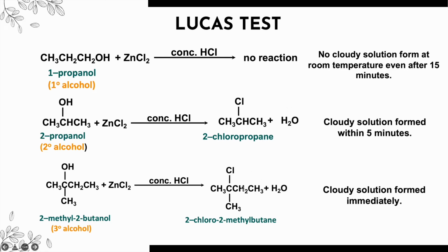Same goes for tertiary alcohol. The Cl replaces the OH group and the side product is water. Cloudy solution forms immediately, which is the observation for tertiary alcohol. That's the Lucas test we use to differentiate different classes of alcohol.